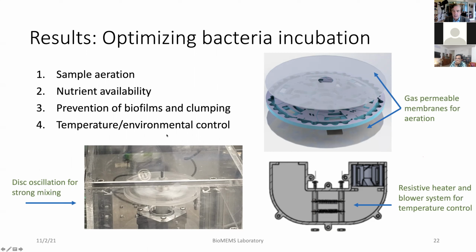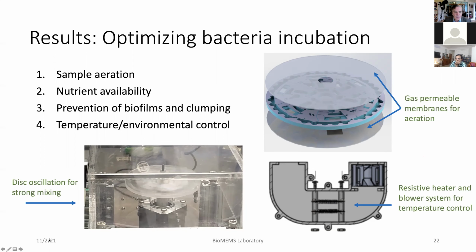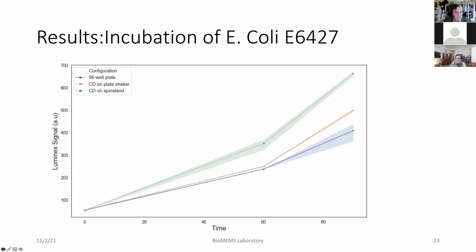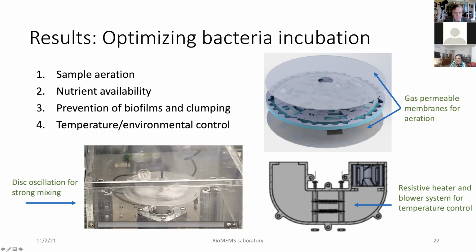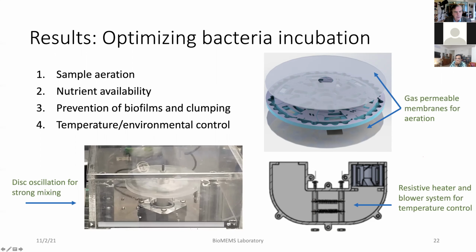Doing that, we have learned that we can actually decrease the incubation time by quite a bit, which is further indication that this is really a very good platform. This movie here shows the CD spinning in an incubator, a prototype, and it shows the disc oscillation for strong mixing. So strong mixing during incubation is also very, very important.